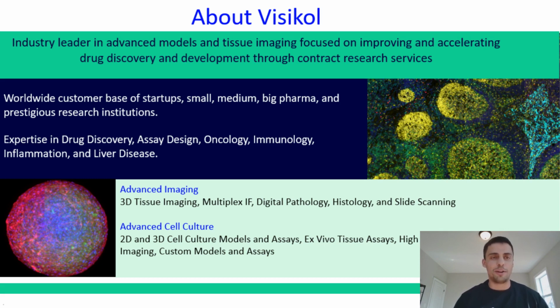And from there, we decided to build out our own advanced cell culture capabilities and end-to-end assays involving advanced cell culture models. And of course, in that space, the high focus area initially was liver, and now we've expanded as an industry to lots of other models, which I'll not touch upon today, but of course, there's lots of other 3D cell culture models that are out there that are now widely used in academic as well as industrial settings.